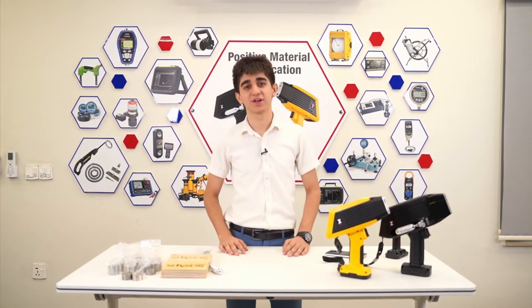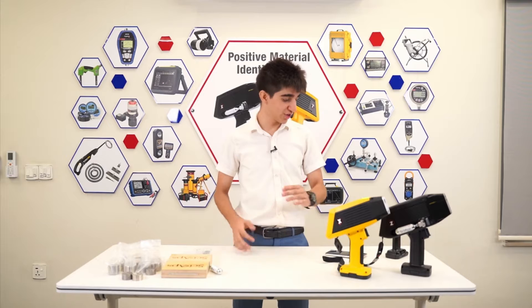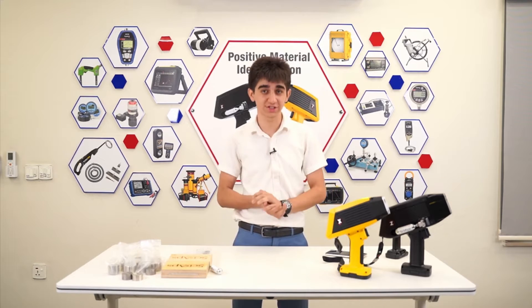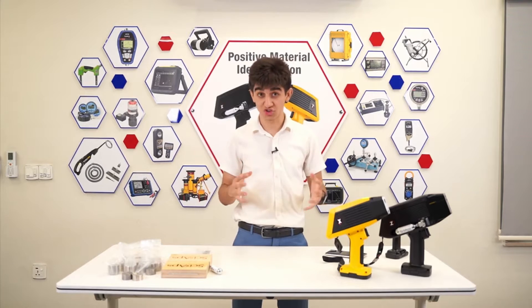Hello, hello everybody. Welcome back to Maqiyasa IC Services. My name is Arkan and today I'd like to present to you two of the best units for performing positive material identifications.